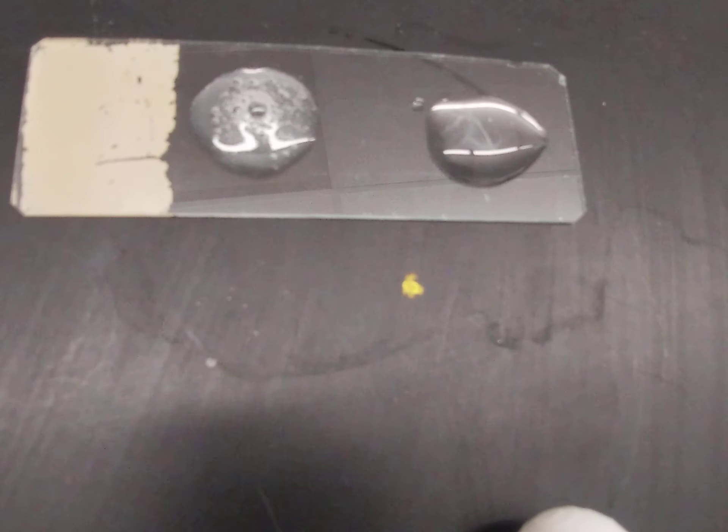You can still see the bacteria on the slide. Sometimes there can be clumps, but it's very clear a positive test has lots of bubbles, whereas a negative test has none.